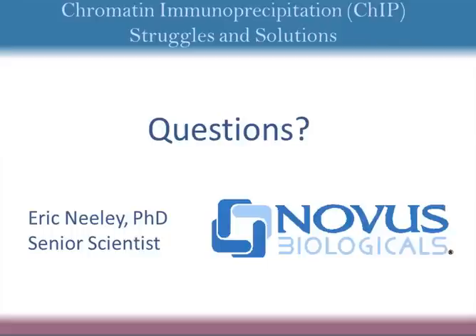And more than anything, it truly is the experimental phase where you're just going to have to see what's best for you by testing different fixation times and different cell quantities. But you will see the difference at the shearing step right away, in the very beginning, of how well it's shearing, and that's really what you're optimizing for more than anything, to get that perfect smear between 100 and 1,000 bases.